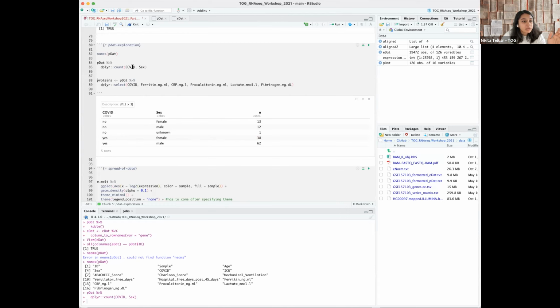If we just remove COVID, and let's just say, is it split well by sex? Because that is something that is a consideration that a lot of people forget, including sex. And in some cases, gender is very important, because that can inform you about your project. Let's talk about, for example, cardiovascular disease. It's more predisposed to men is the general consensus, which is true. But did you know that after menopause, women are actually more likely to get heart disease? So these kinds of checks are very important before you even go into your data.